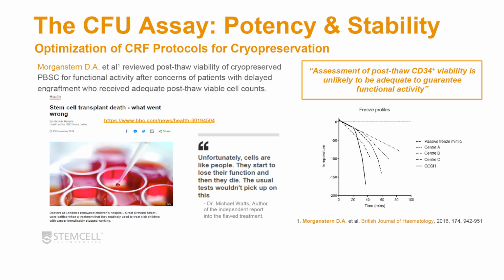When you look at the Gosh Hospital, the temperature dropped very quickly, which is non-optimal. When you're doing freezing programs for hematopoietic stem cells, you want to freeze them at a degree per minute, and that has to be maintained till at least past minus 50 degrees, otherwise that can really affect the functional output of the cells.